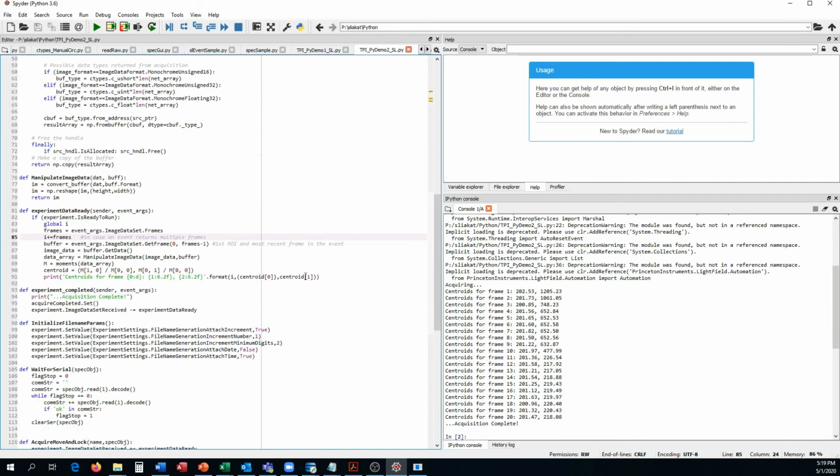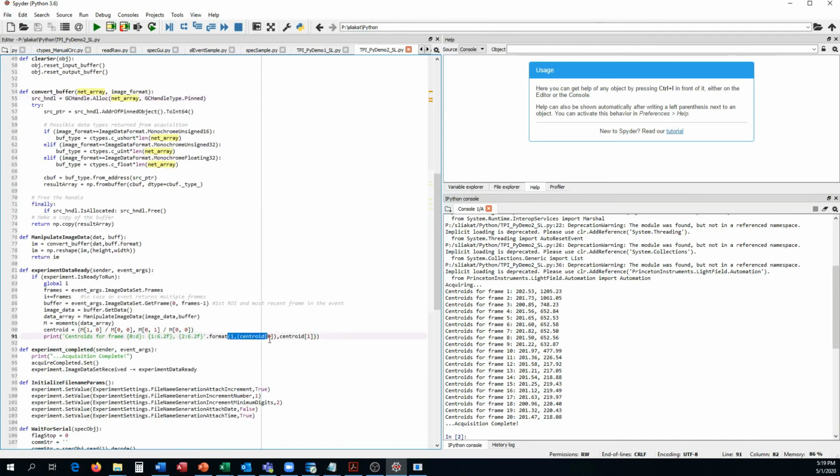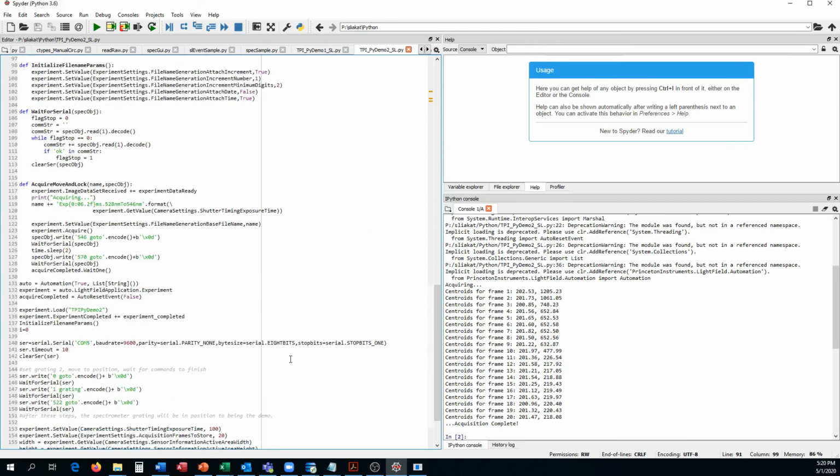And Python's amazing. It's open source. It has all sorts of libraries that are used for peer-reviewed articles, and they're verified. The scikit-image, NumPy, sklearn. If you want to calculate moments, you want to calculate centroids, it's just two lines, as you can see. And these are all verified, open source. You can see exactly how the calculations are done to verify their accuracy. So Python is what you want to be using for this.